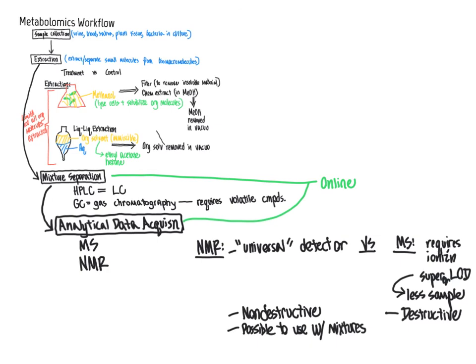And also, when a sample is directly injected into the mass spectrometer without prior separation by LC, there is not really sufficient selectivity to detect and evaluate the breadth of metabolites that would be present in a sample. And so mass spec generally requires that the sample be subjected to separation beforehand, whereas with NMR, in some cases, this mixture separation step can be skipped.